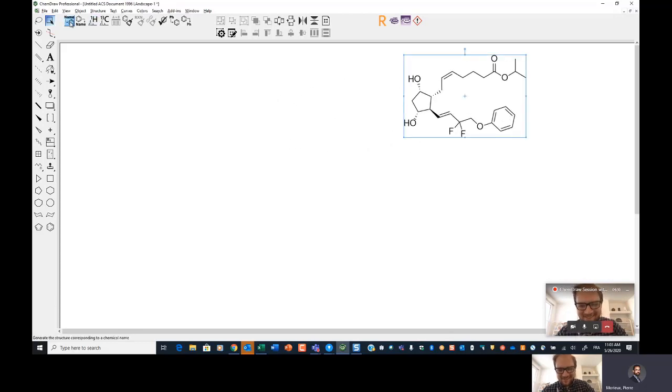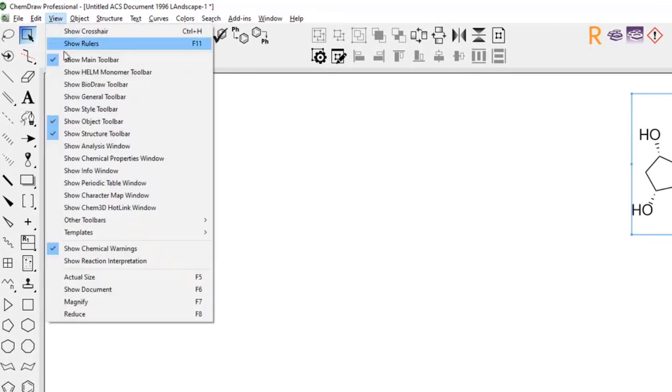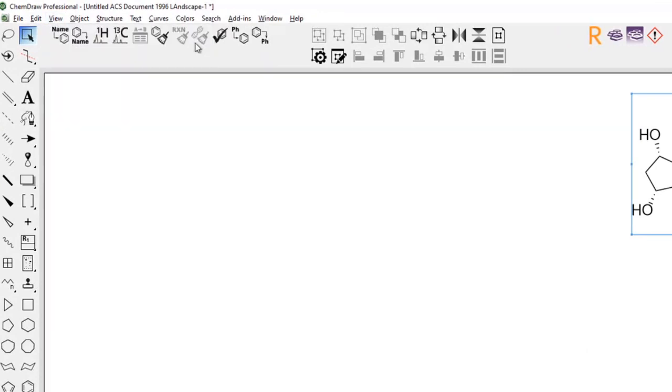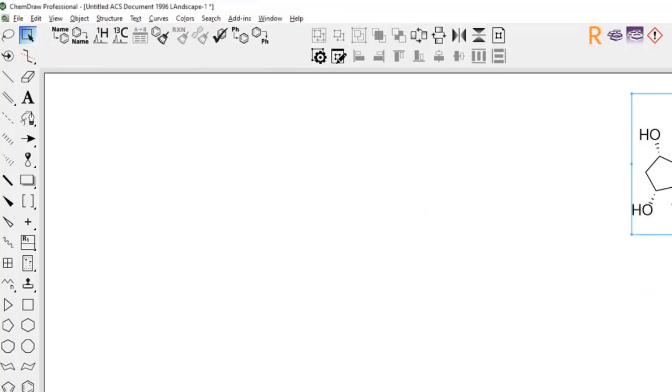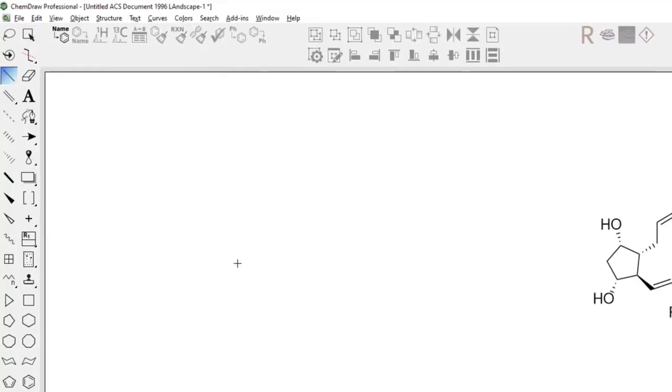Name to structure, which is this guy here. So view, show structure toolbar, and then name to structure, or Control-Shift-N, or Command-Shift-N on the Mac. Okay. Now, how would you, how could you do this?